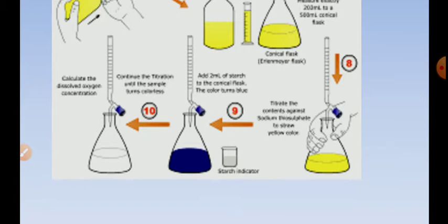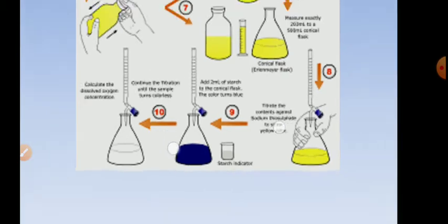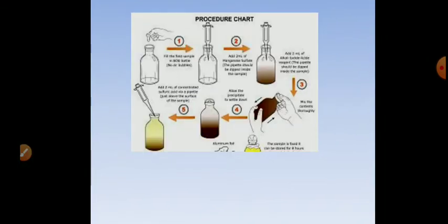Okay, so what you have to do: take a BOD bottle, fill it completely with the water sample, stopper the bottle, and remove the excess water.